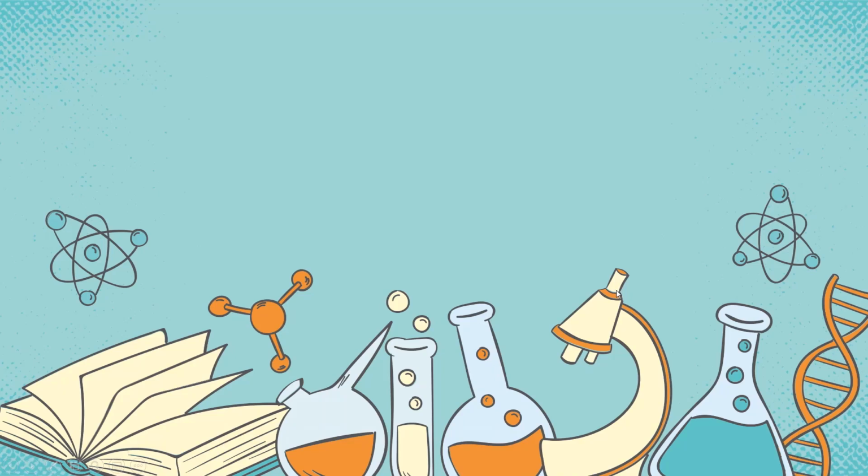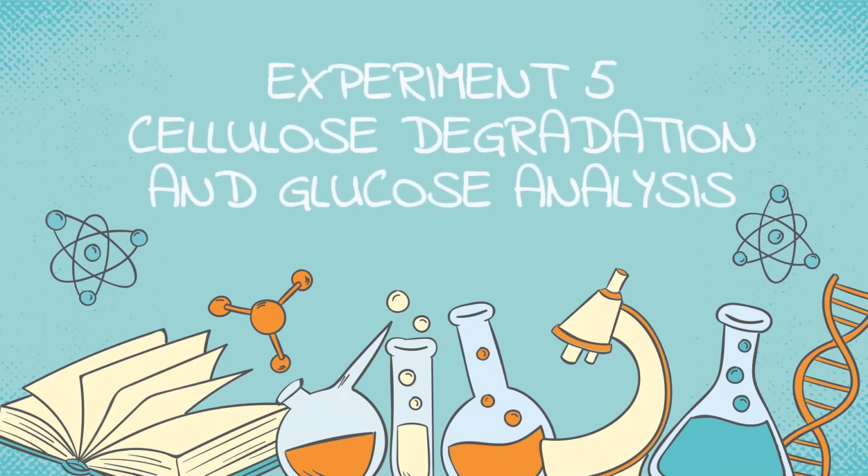Good day everyone. Today we are going to present Experiment 5, Cellulose Degradation and Glucose Analysis.